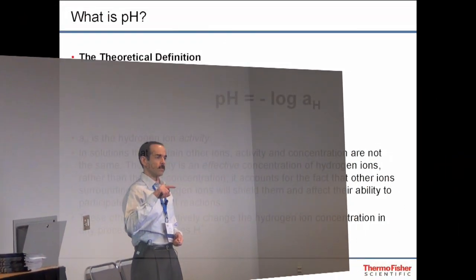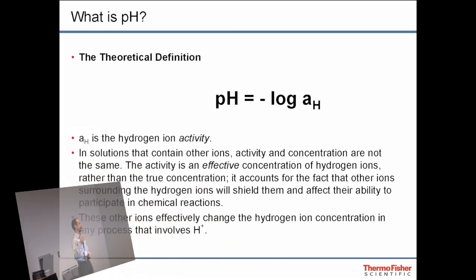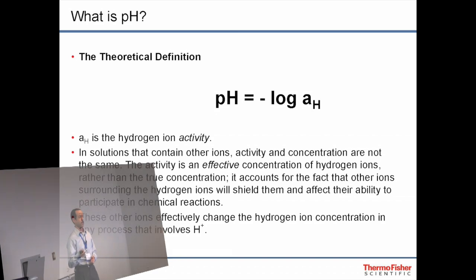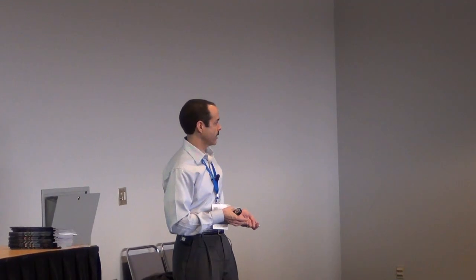When you're measuring pH, what you're actually doing is measuring hydrogen ions. The reason it's a little lowercase p, capital H, is because originally that was a reference to the power of hydrogen. Essentially you're measuring hydrogen ions in your sample, in your water, in whatever sample, whatever industry. The other important takeaway is that it's a logarithmic scale, so it's a factor of 10. A log is a factor of 10. As we'll see in the pH scale, even though we might be talking about a unit or two in terms of pH, it's a big deal in terms of how acid or how basic that sample is. So pH is the negative log of the hydrogen ion activity. Now you know.